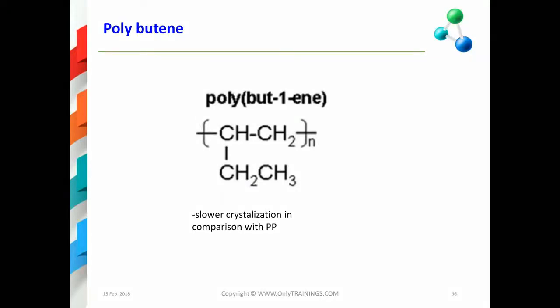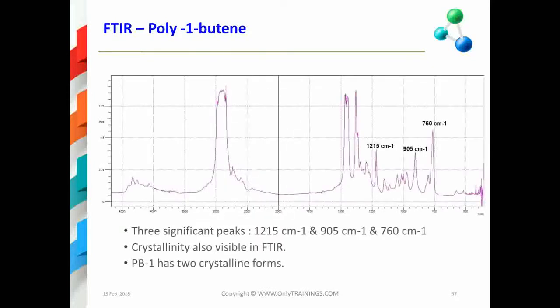form to another form after a few hours. In infrared, you get something like that. Again, no polyethylene, you can see, but this is another peak at 760 centimeters -1. And I think you can see over here also the crystallinity. That's over here, yeah. And as I've mentioned, it has also two crystalline forms. Probably we can see it also here on infrared.